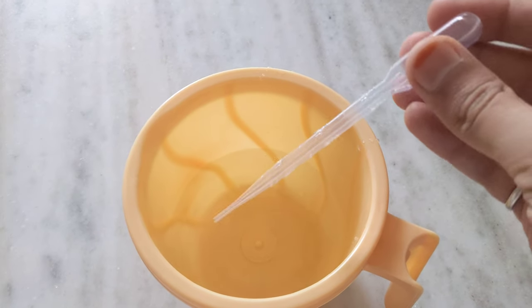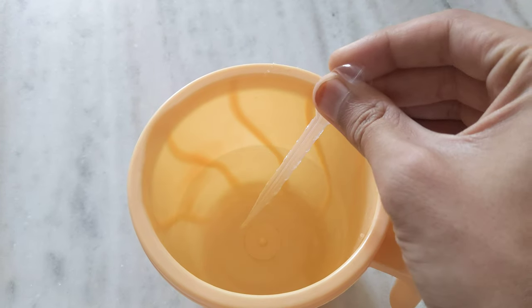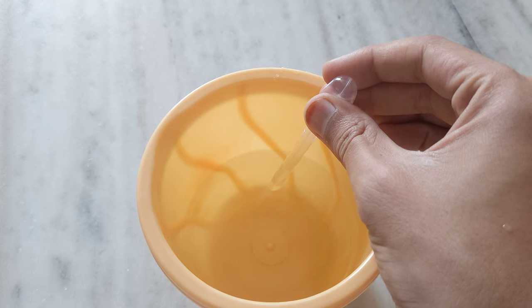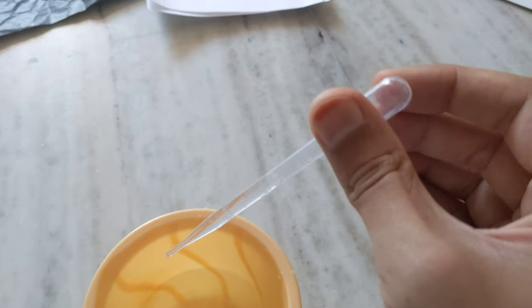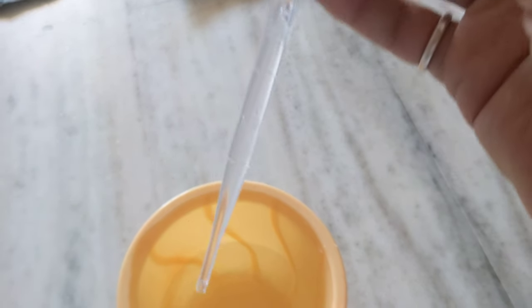I want to fill this water into the pipette. I will press it — now the pressure is there — I will put it in the water, and due to the pressure difference the water will come up. Now if I pick it up, the water is still there inside.